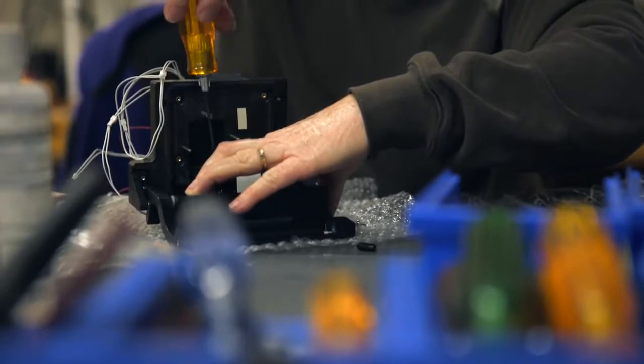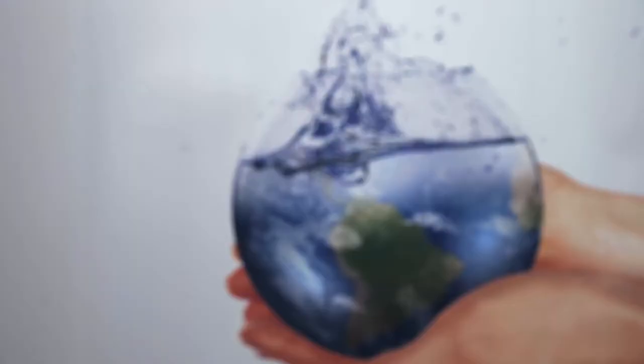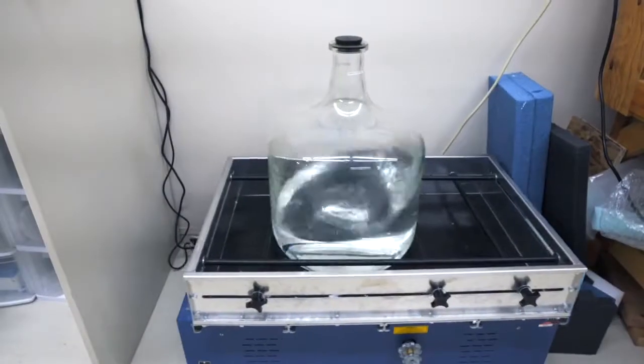We are a manufacturer and developer of water quality analyzers. Our aim is to make water quality testing faster than it's ever been done before.